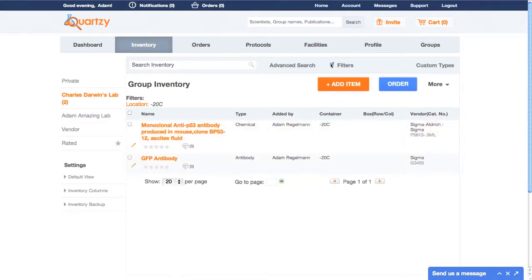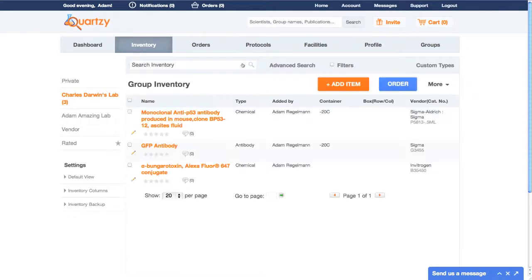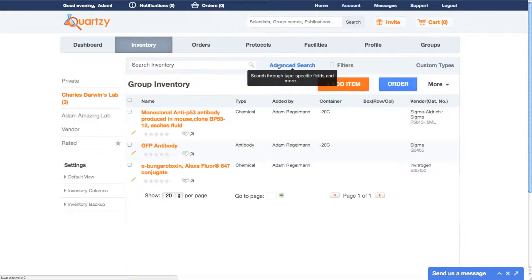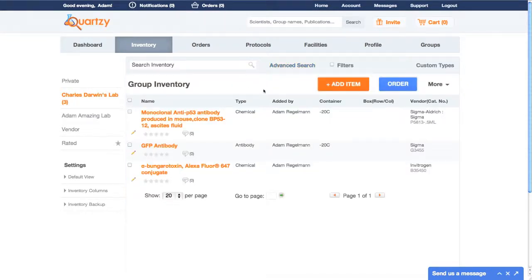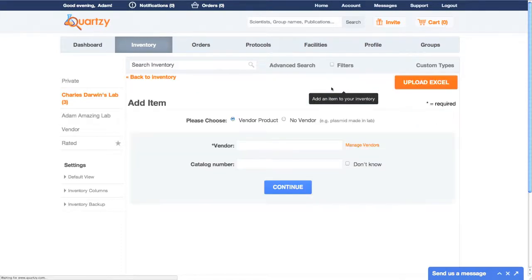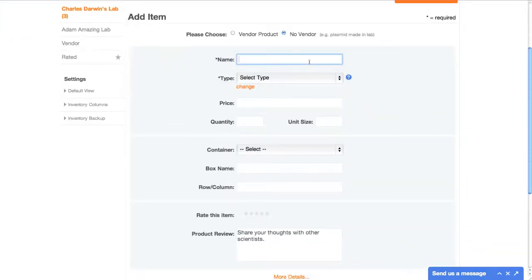And of course, you can always use our powerful search and advanced search features to quickly find items you're looking for. In addition to vendor-purchased items, many Quartsy folks use the site to keep track of experimental samples or stuff they make in lab, like cell lines or bacterial stocks. You can add these items as non-vendor items from within Quartsy, or upload them using our Excel template, just like with commercial items.